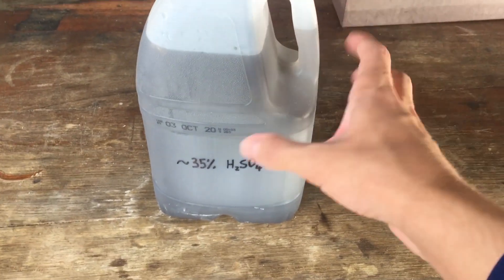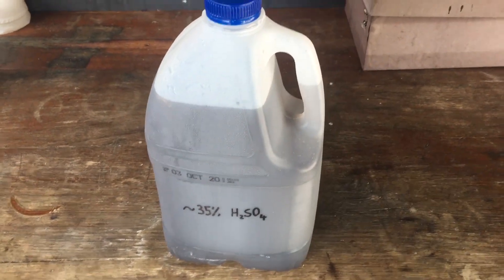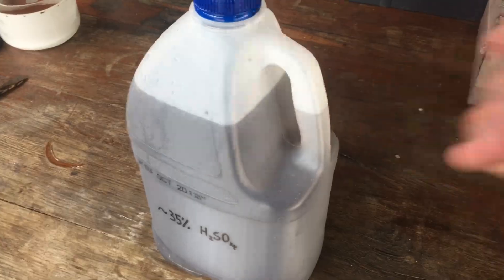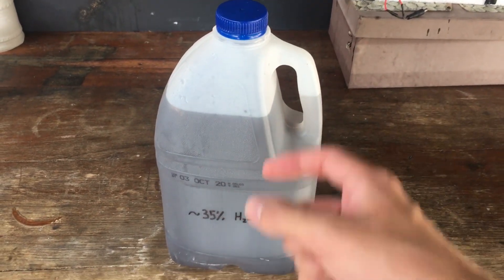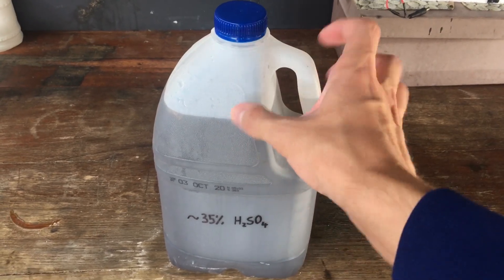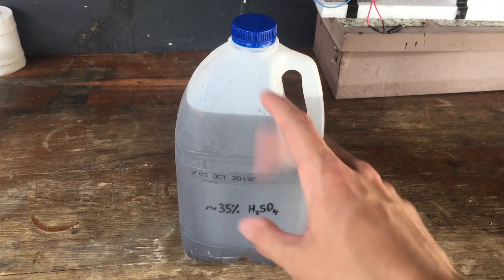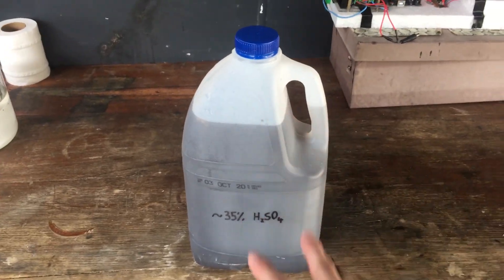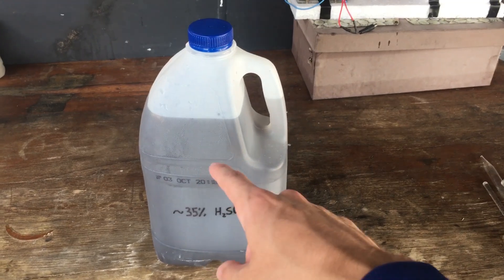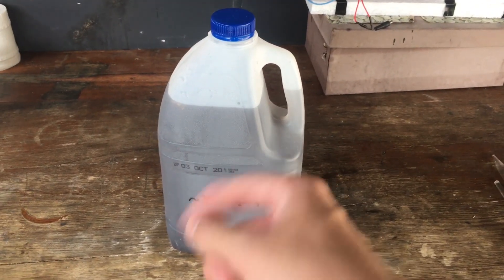You'll notice that the acid we extracted is very, very dark and doesn't look very pure. That is, of course, tiny little bits of the lead and lead dioxide electrodes from the battery in suspension with our acid. So what we're going to have to do is wait maybe a day or two for all of those to settle out, and then hopefully we'll be able to just pour off the top of our sulfuric acid to get some pure stuff.